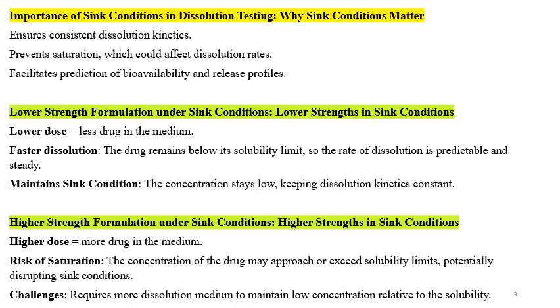What is the importance of sink condition in dissolution testing and why are sink conditions required? Sink condition is required to ensure consistent dissolution kinetics. It is required to prevent saturation, and this saturation can affect the dissolution rates. Sink condition facilitates prediction of bioavailability and the release profiles. If we work without sink condition, there are more chances that saturation will happen and the true picture of the dissolution profile will not be reflected by the dissolution testing.